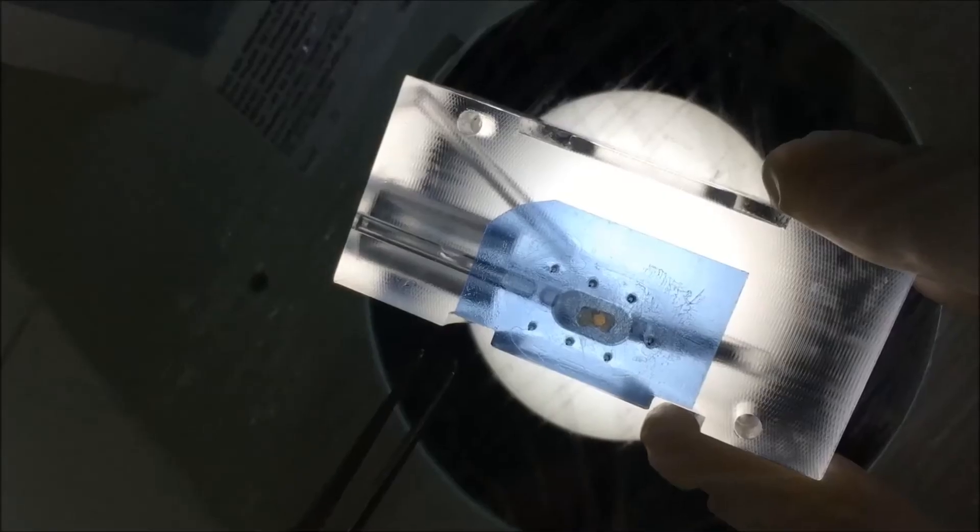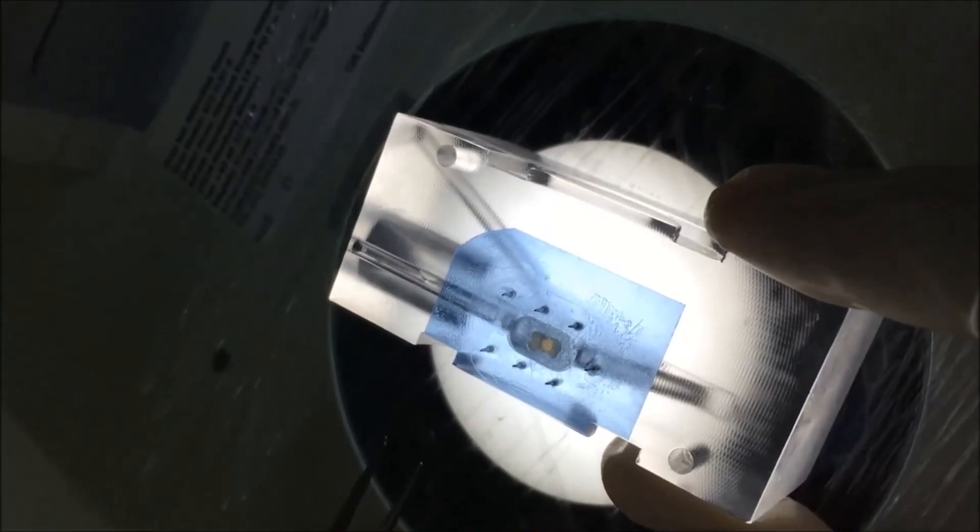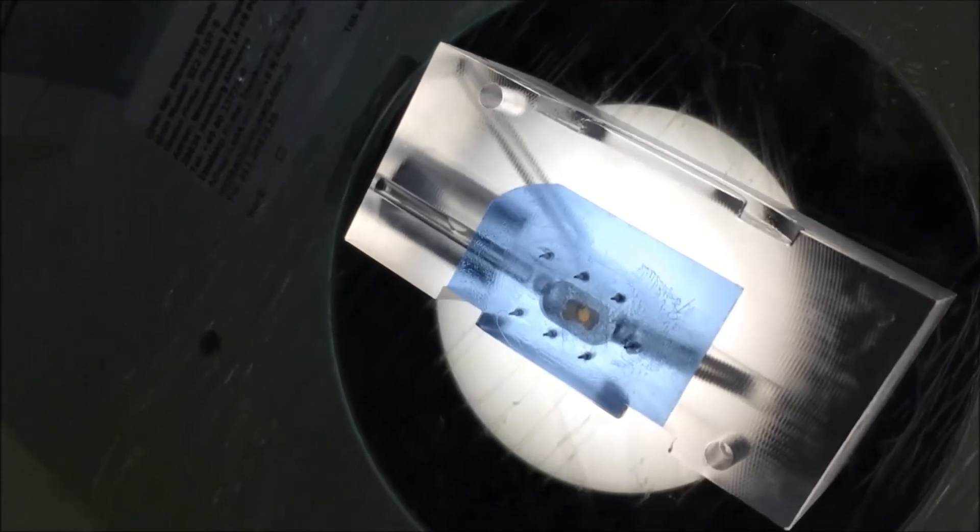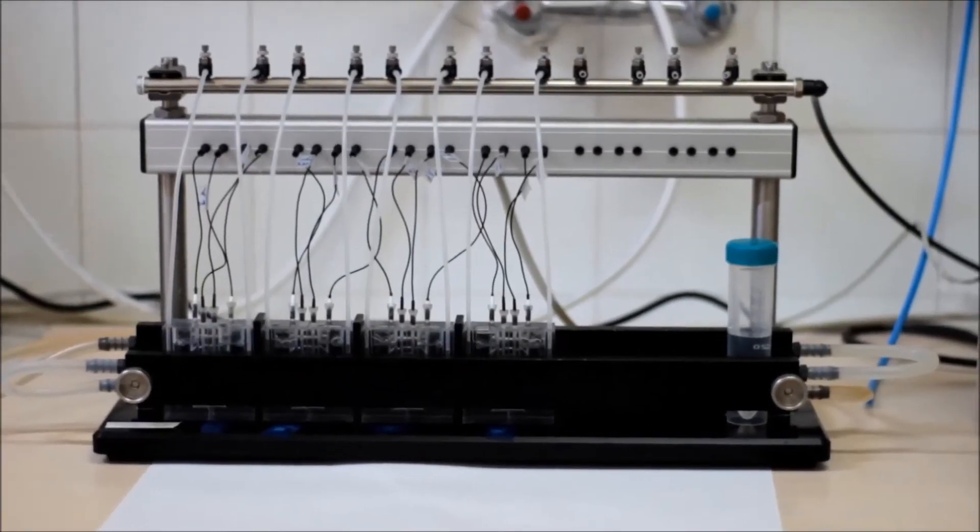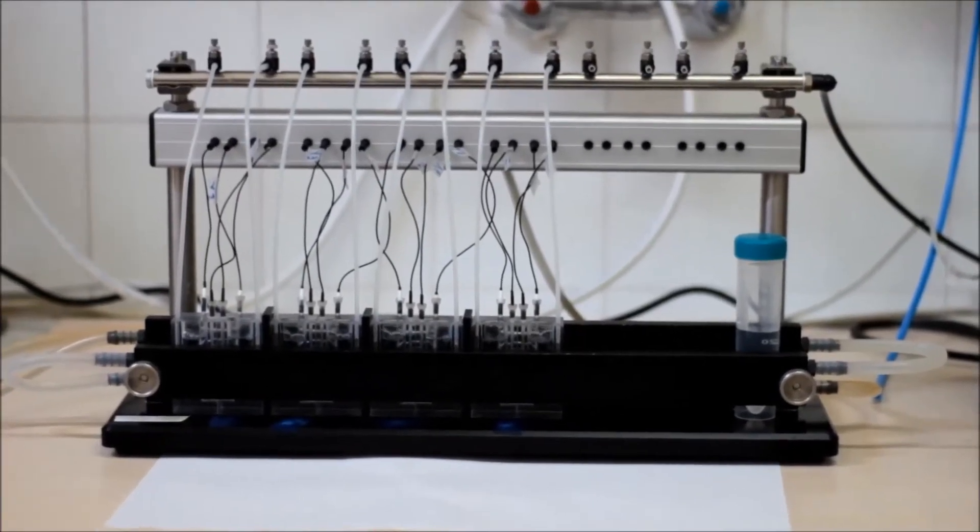The Ussing chamber isolates the apical side from the basolateral side. The apical side of the epithelium should be on the top. Close the chamber with the ring and fill it with Ringer solution again. Repeat the procedure same as before the calibration and apply for the rest of the chambers.